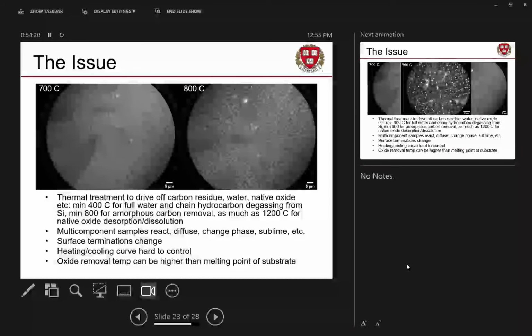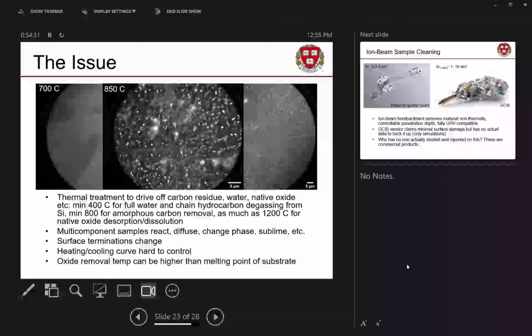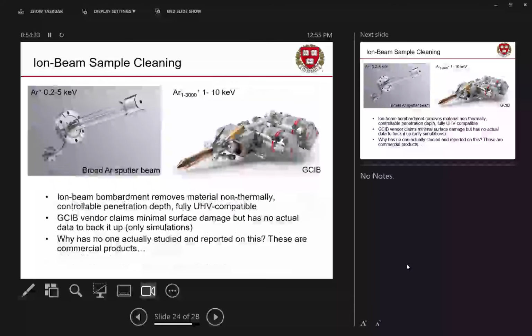We can't exfoliate in situ because this was a device that somebody made, right? We're not going to go peeling bits of it off with tape or it won't be the same device. So what the heck do we do about that? Yeah, this is what happens if you keep going. Eventually, it's just chunk everywhere.